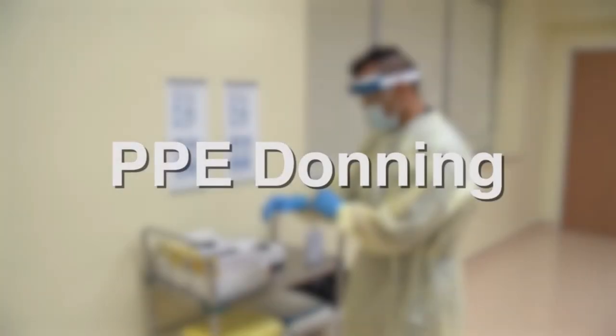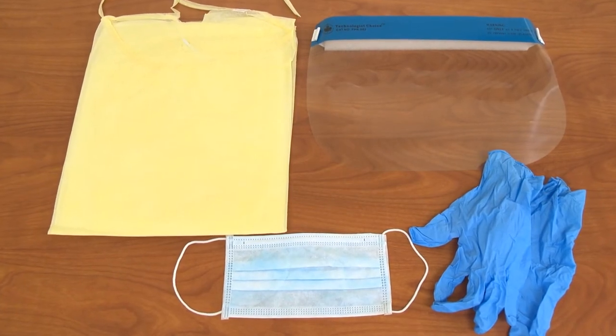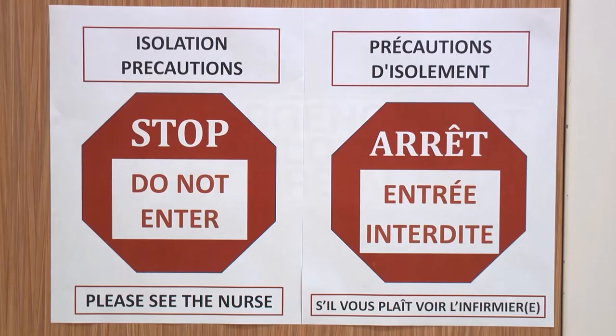Donning of Personal Protective Equipment. Let's review putting on the following personal protective equipment or PPE: a gown, mask, face shield, and disposable gloves. You may need to wear PPE before entering an isolation area or when performing certain cleaning tasks, based on your risk assessment.